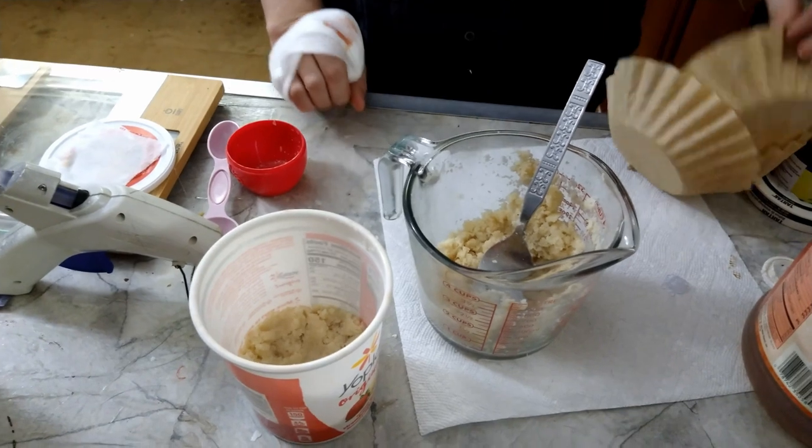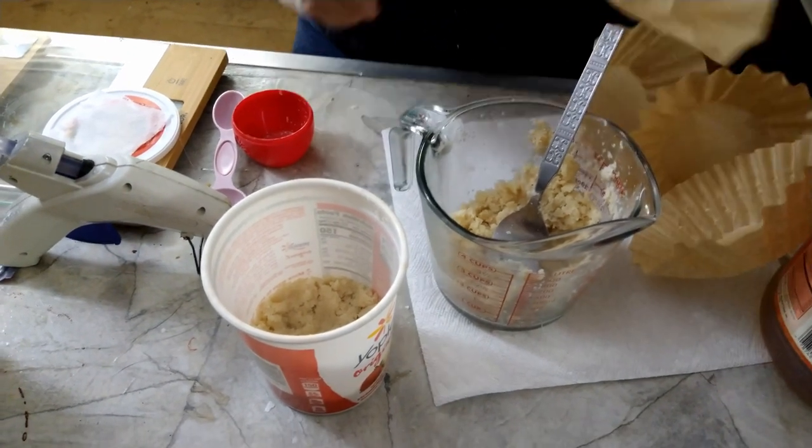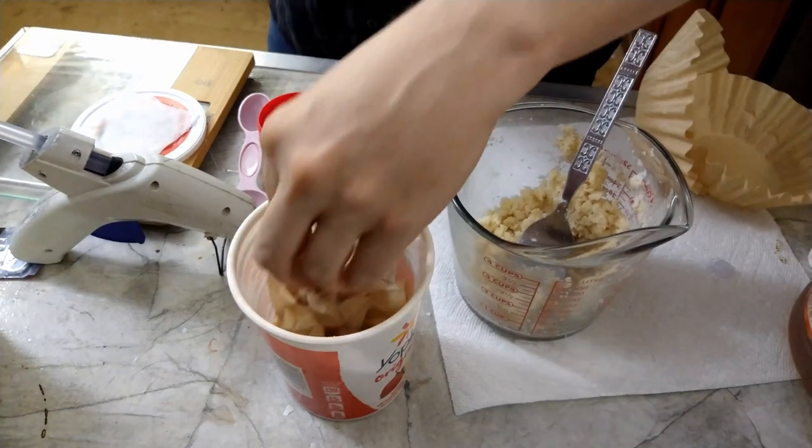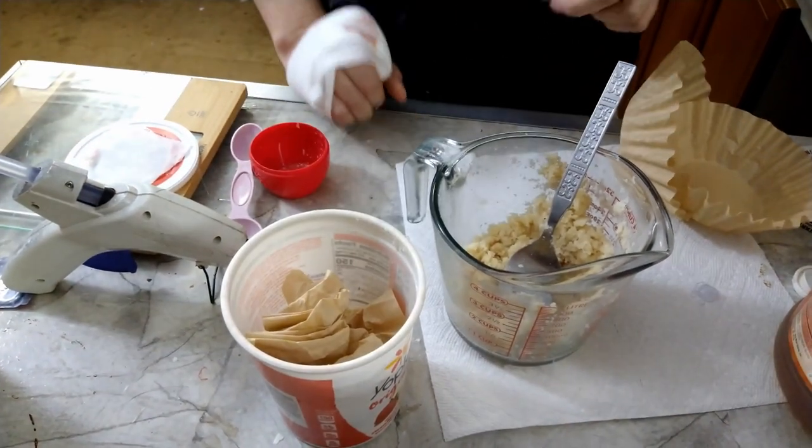You want the flies to have someplace that they're going to be able to rest and crawl around, so I'm just going to wad up some coffee filters and throw them in to give the adults someplace to crawl around.